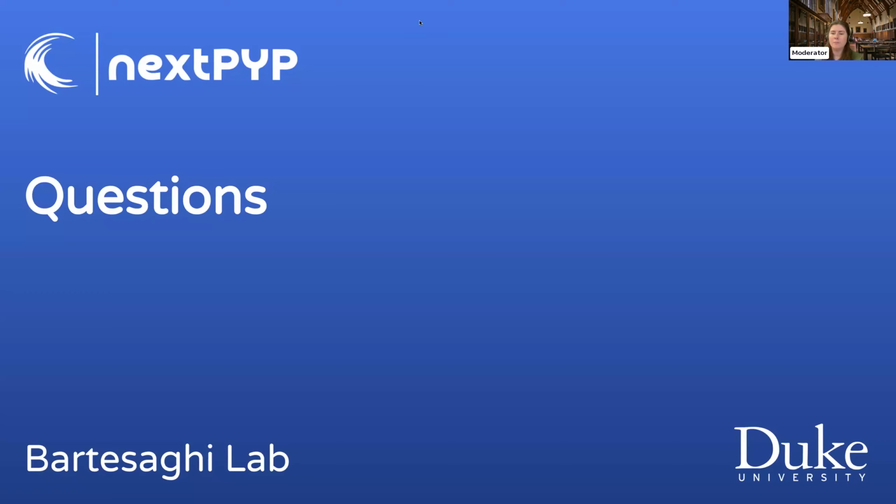Okay, next question is from Asa: have you optimized nextPYP on specific high computing architectures, specifically thinking about Intel versus AMD CPUs? Yes, so we've done some effort regarding optimization in general, right? So CPU optimization. Nothing that is specific to the architectures other than using the Intel compiler and building on top of system code that has been heavily optimized for the CPU architectures.